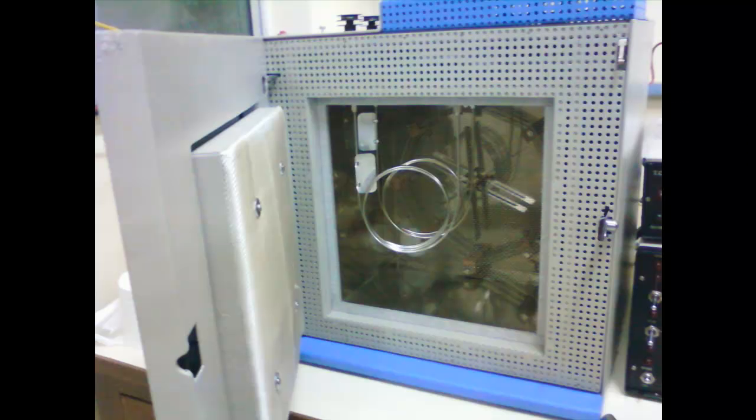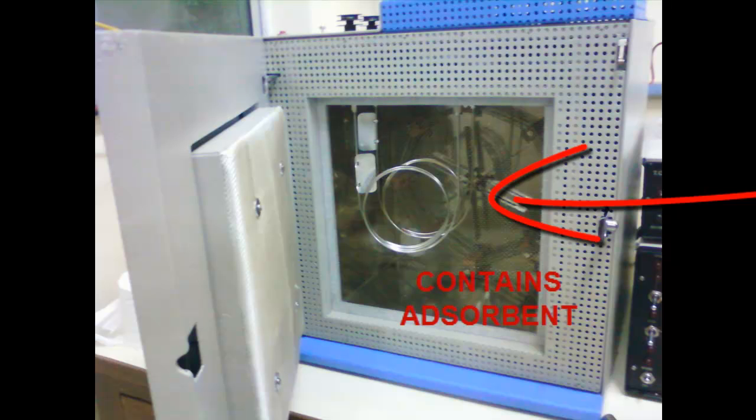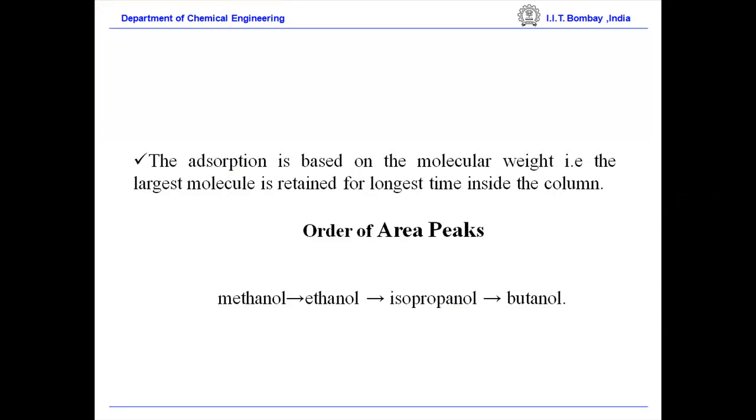The components of the sample are adsorbed on the adsorbent bed in the GC column. The adsorption is based on the molecular weight, that is, the largest molecule is retained for the longest time inside the column. Thus, the area peaks come in the order of methanol, ethanol, isopropanol, and butanol.